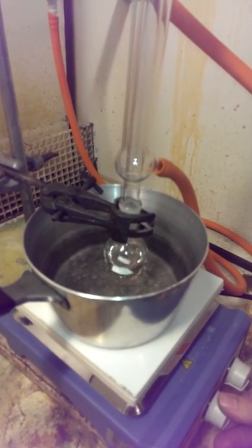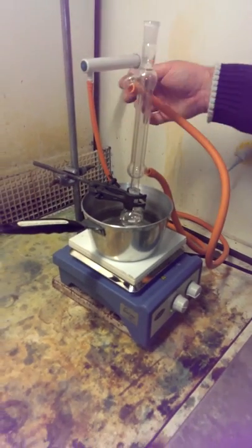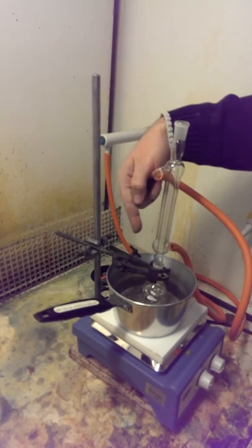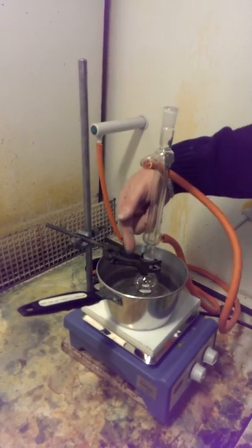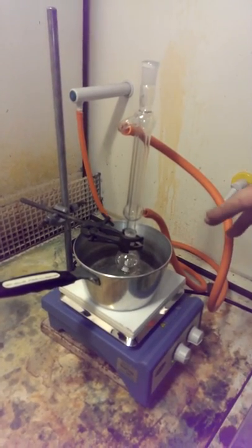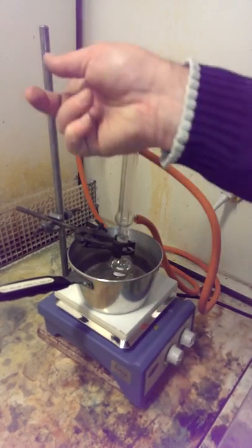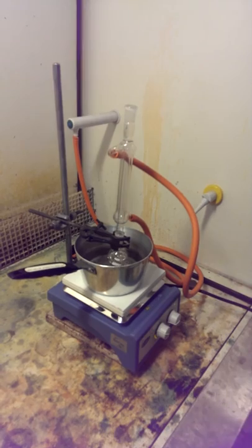Spin it, set it heating, your water should be flowing. At this point, it's best to clamp the thermometer into position in the oil bath so you can record the temperature of the oil and what it's boiling at. So if you were to distill toluene at 110, make sure your oil bath is at about 130. So get a thermometer and clamp it in position at this point and record the temperature. And that's how you distill.